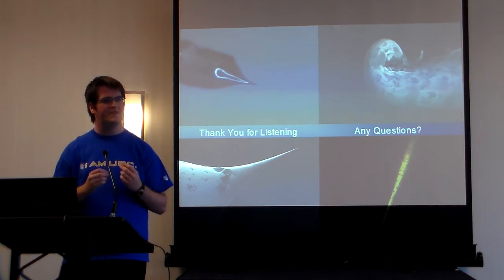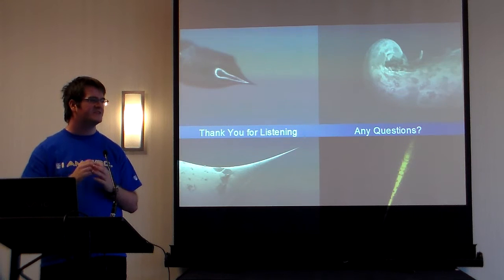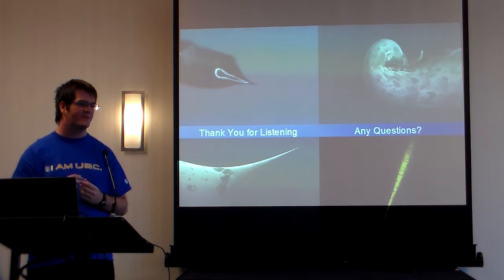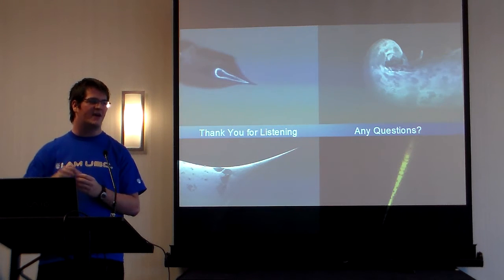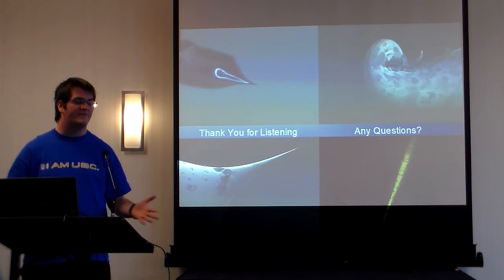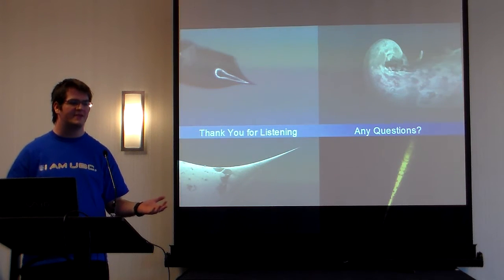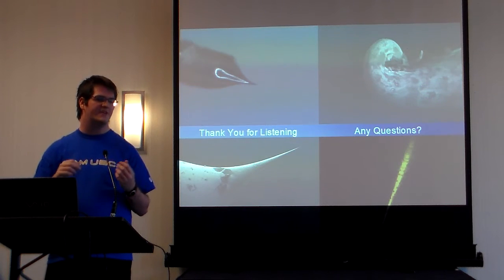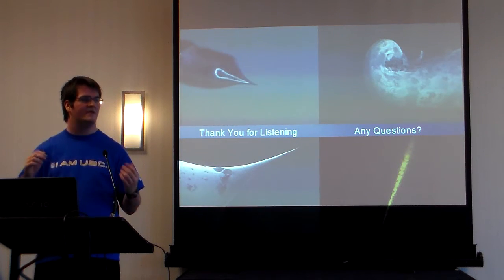Okay. So I'll start with tungsten. Tungsten is basically the standard. It's what most people use. The other one that most people use is platinum iridium, but they cut it so it's not etched, and so those tips are never reproducible. You just basically get lucky. But those ones also aren't good if you have, say, bumps in the surface.